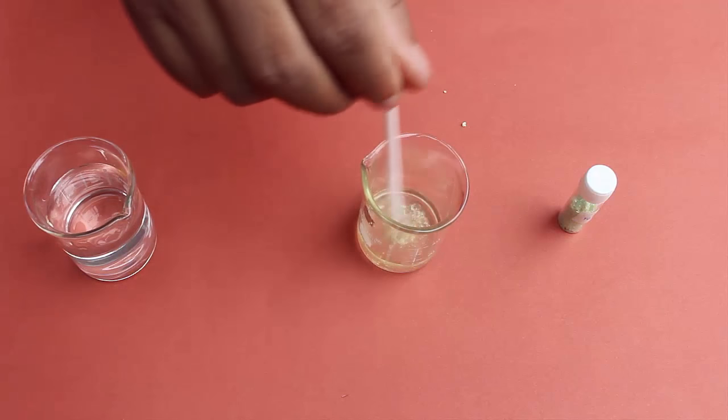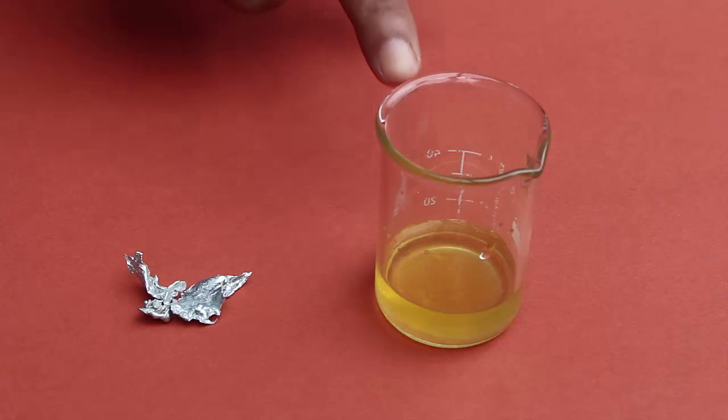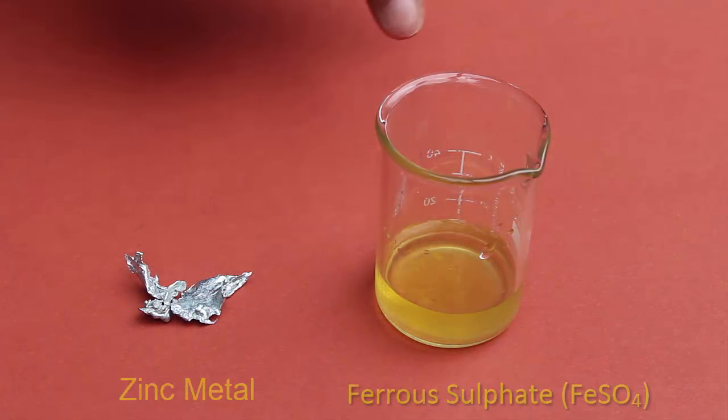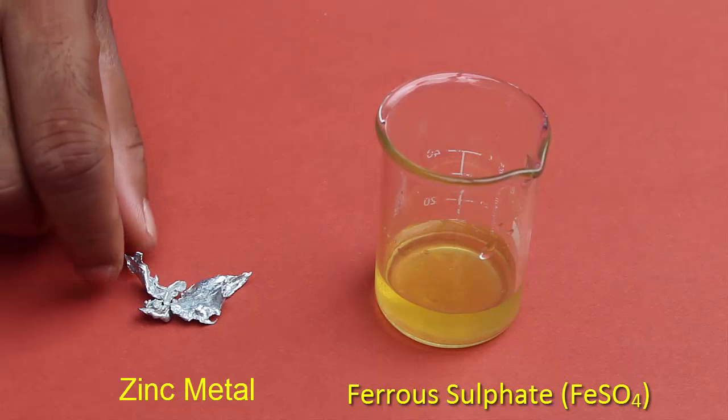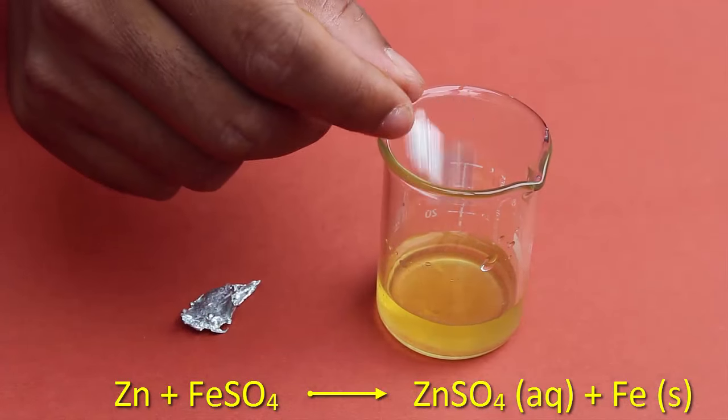So now we have this solution of ferrous sulphate which is little bit faint in color, faint green color. So in this solution we are going to add some zinc metal.